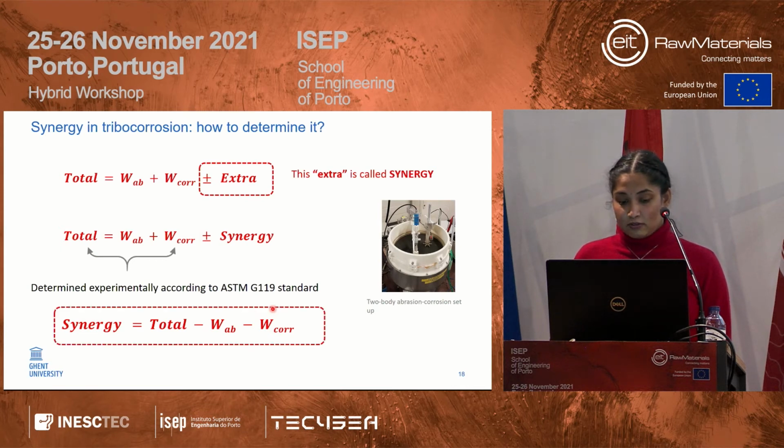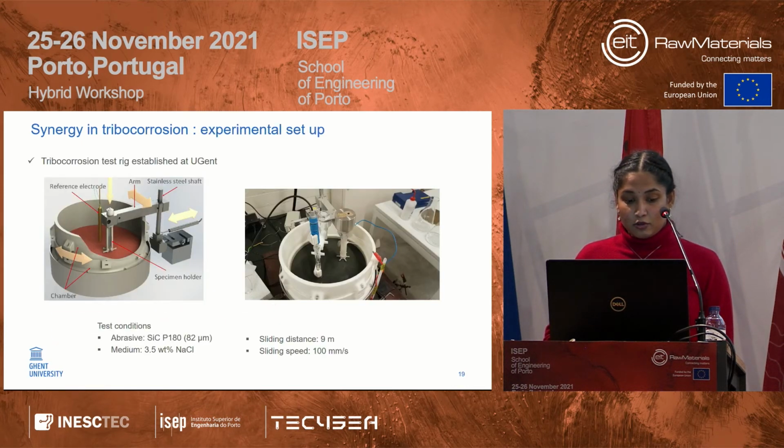The test rig that was developed is this, as you see on your left. We have a sample at the bottom, which is probably 8 mm in diameter and 10 mm in height. We have an abrasive paper at the bottom, which is silicon carbide or alumina, whatever you can choose. And we have a corrosive medium and an electrochemically controlled environment. That means we have a reference electrode here, with which you can apply a desired potential, and you can stop the corrosion from happening or accelerate it.